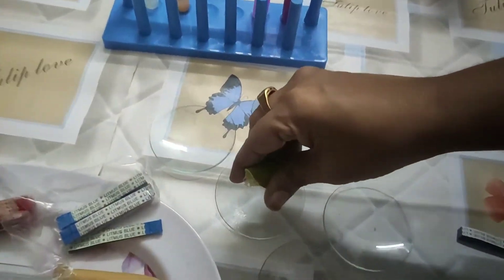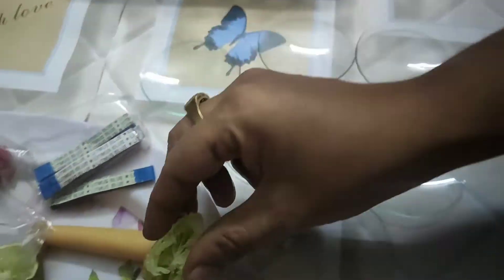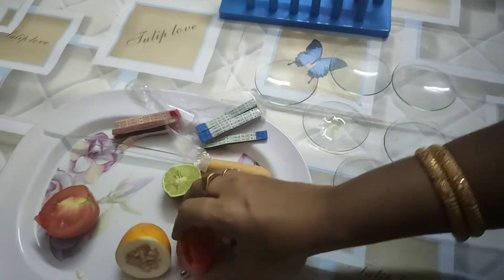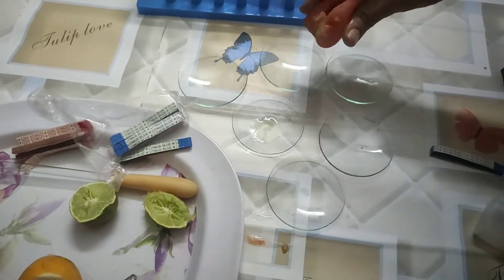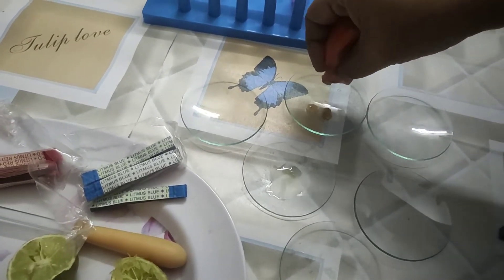Hello children, today I want to show you how to test acids and bases by using litmus papers. Here I am taking a few samples — lemon juice and tomato juice. I am squeezing some juice onto the watch glasses.